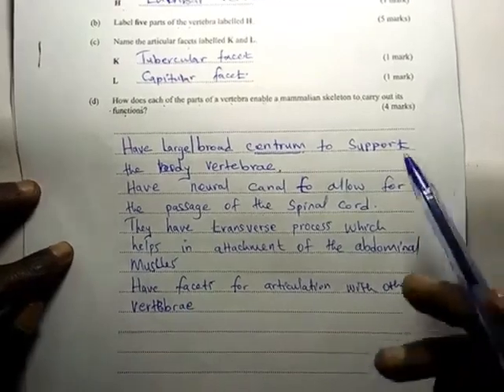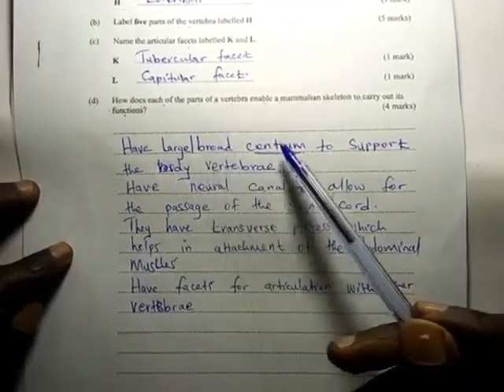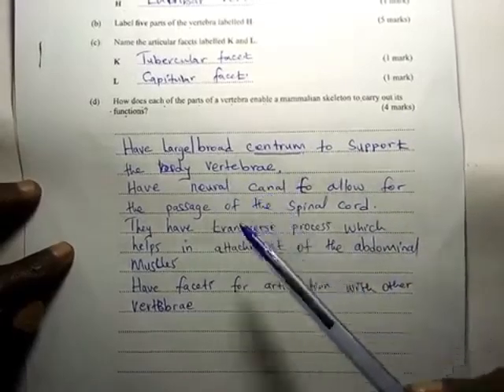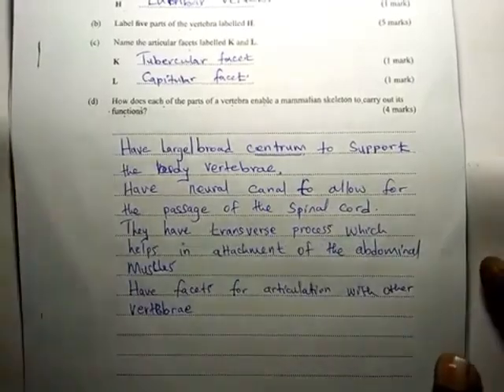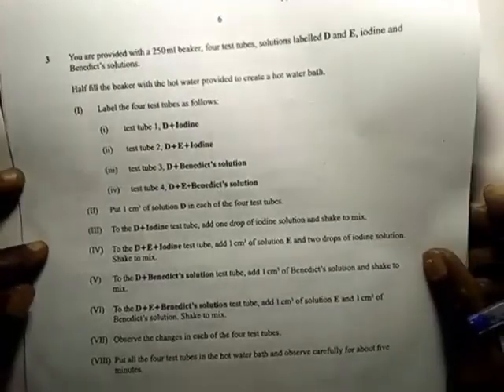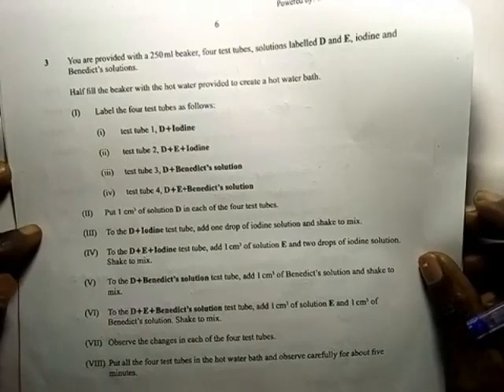Now we have answered our 4 marks. The first, we have centrum, neural canal, transverse process, and facets. Now number 3, our last question is on food test. You are provided with a 250 beaker, 4 test tubes, solutions labeled D and E, iodine and Benedict solution.